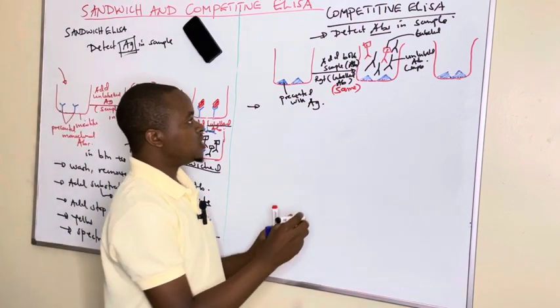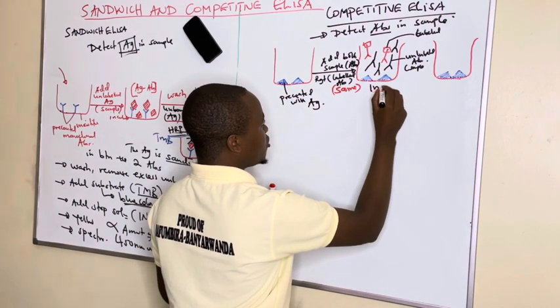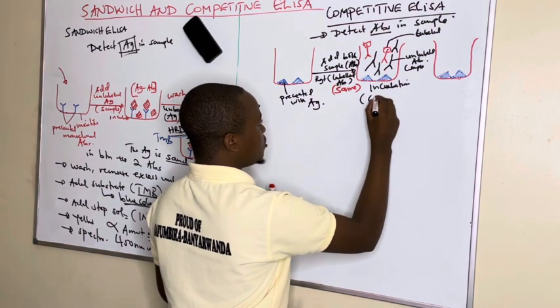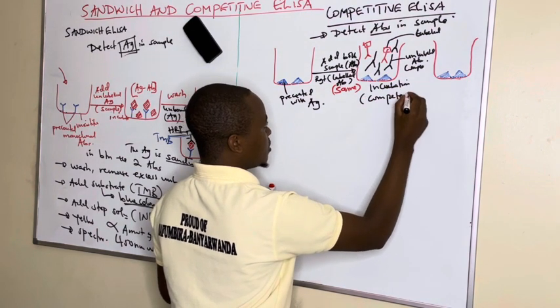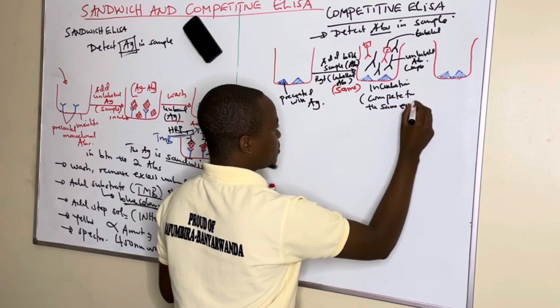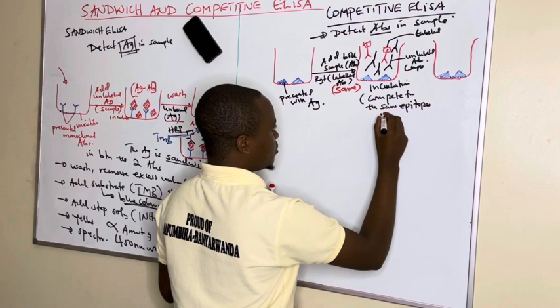During incubation, they compete. So we see competition during incubation. So during incubation, they compete for the same epitopes on the antigen.